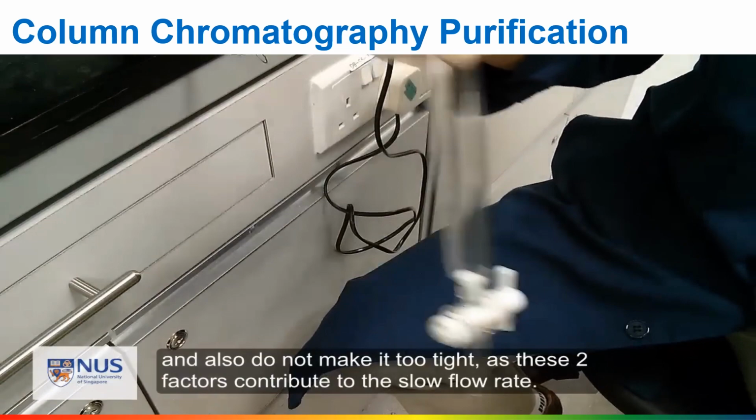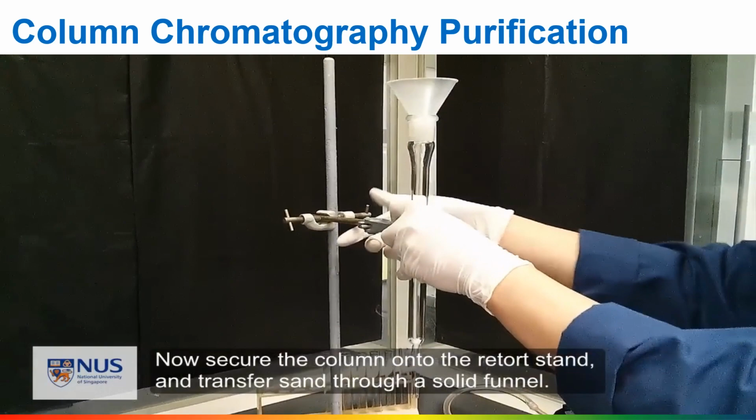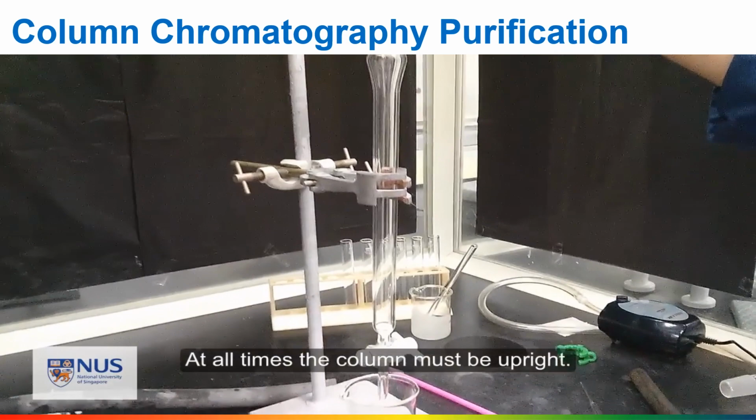Now secure the column onto the retort stand, and transfer sand through a solid funnel. At all times, the column must be vertical. Make sure the sand layer is level.